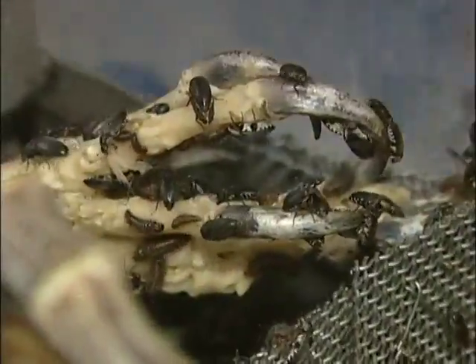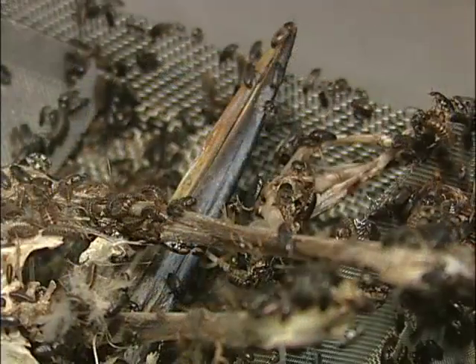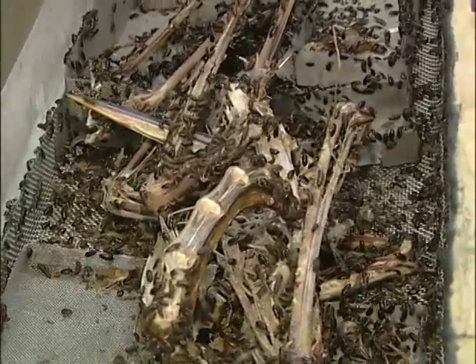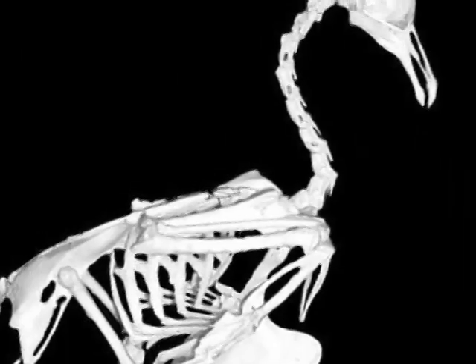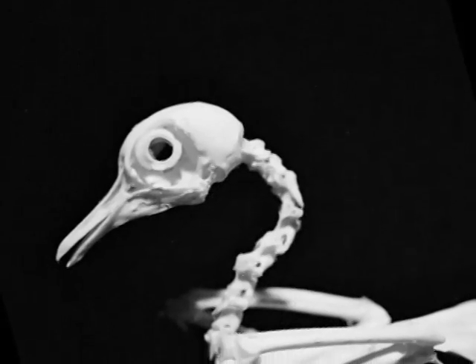This is a process that's been used since the time of Aristotle to produce skeletons, and this is probably the most commonly used technique for making skeletons in museums around the country. It's a very good process for this because they basically leave the bones intact, and if you catch it just right, the skeleton's pretty well articulated, and so other than just a little final cleanup at the sink out there, the skeleton is done.